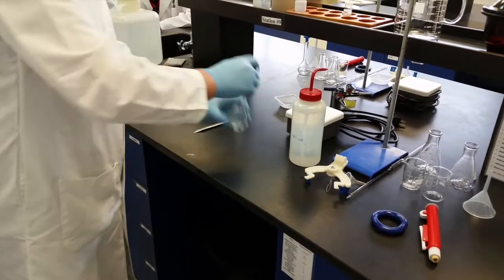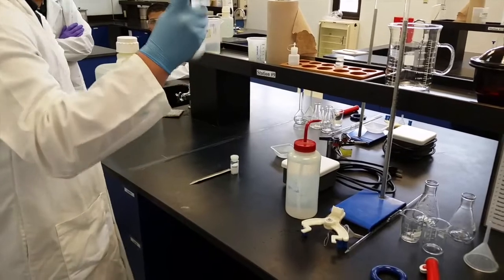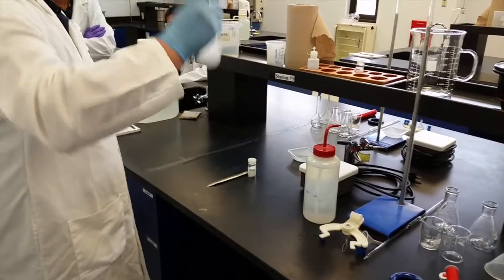Don't fill to the mark until you see all your solid has dissolved.